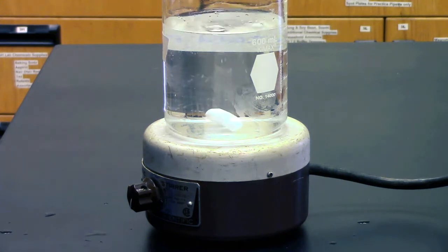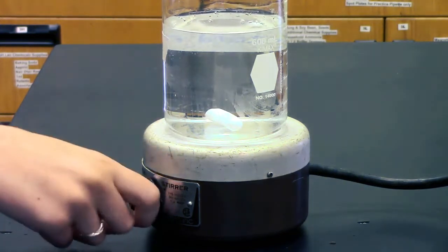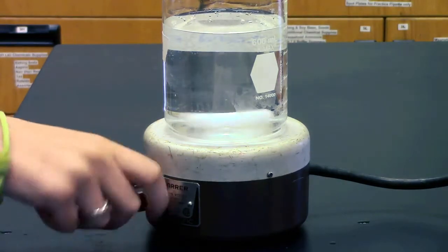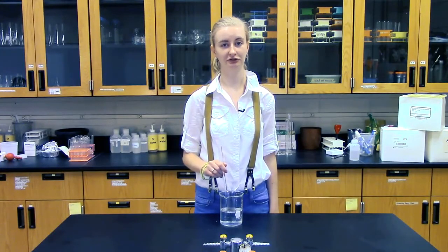The stir bar is magnetic. Inside the stir plate is another magnetic bar that spins. Once you turn it on, it forces the stir bar to rotate. It's a really useful way to stir solutions in the lab without having to stir by hand.